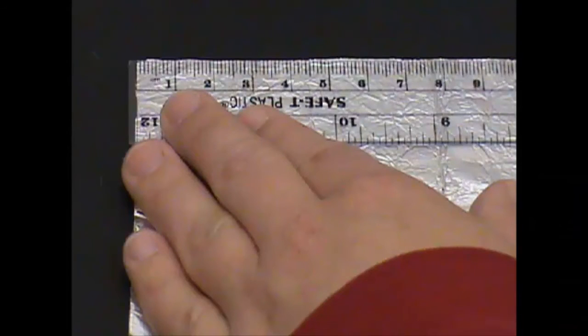For Part 2, thickness of aluminum foil, you will be measuring aluminum foil using a ruler. Use the centimeter side of the ruler to measure the aluminum foil. Each tick mark is 0.1 centimeters. If you need help with the calculations, please see your instructor.